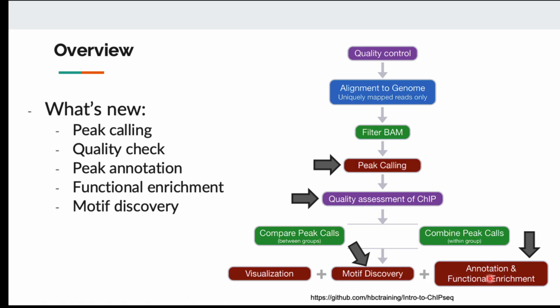First, we want to understand if our peaks, like where transcription factors bind or where histone modifications occur, associate with any gene function. Are the nearby genes involved in certain pathways? Because if a transcription factor binds at a certain location, we assume it's going to activate genes near that location. So we want to understand, in our disease or treatment sample, when a transcription factor binds a certain location, or when histone modification occurs at a certain location, do they try to activate or replace certain functions of the gene, certain gene pathways, for example.